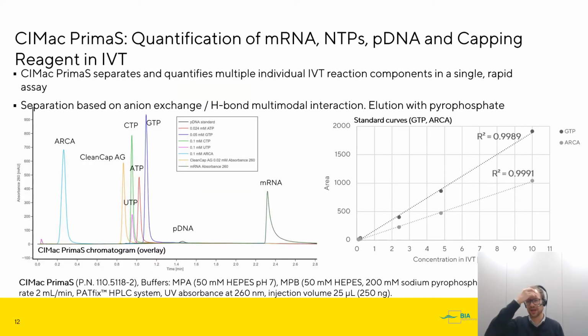Let's start with anion exchange mixed mode with hydrogen bonding interaction. So the PrimaS column, which is exceedingly useful as an analytical tool, operated in pyrophosphate gradient.